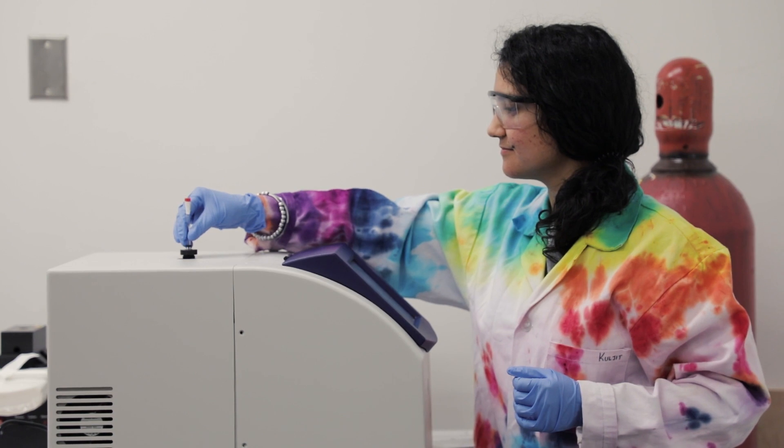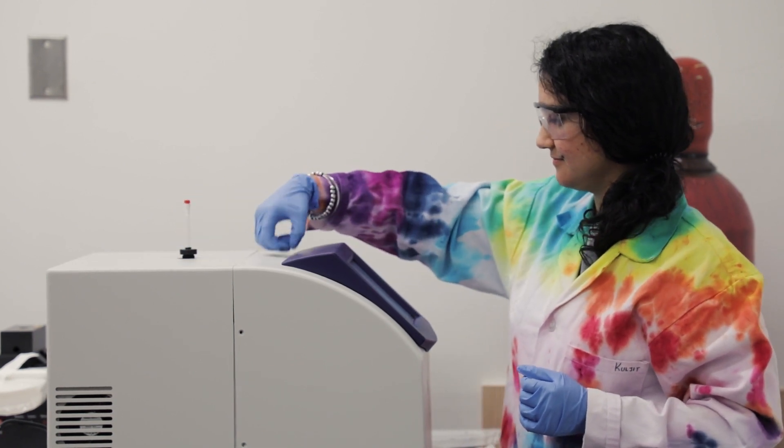Both of these instruments enable our students to investigate compounds that they synthesize in lab, enable them to determine structures in two distinctly different ways.